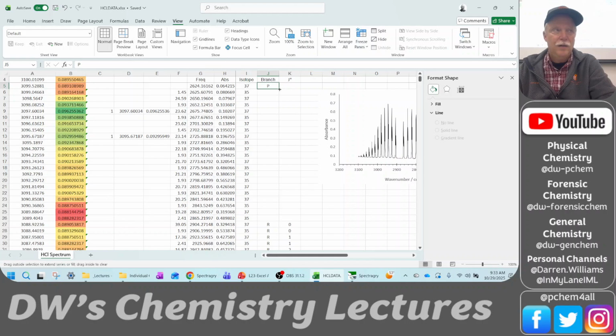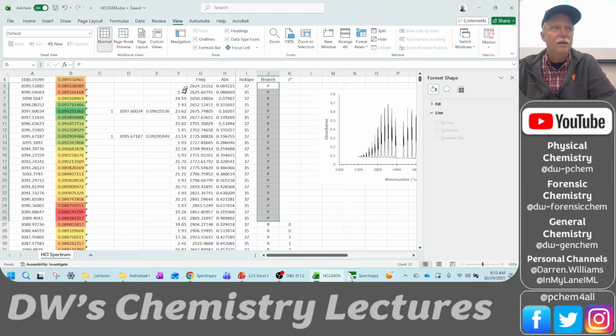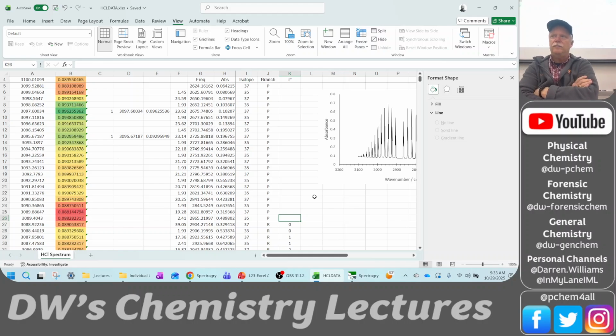Yes. Any question? Yeah, because there's nothing above it. That's fine. And then, what's the first P value? The first P line, like the designation, the J value for the first P transition. We don't have negative rotational quantum numbers, so that's why we can't have a P0. You remember stuff that you miss, right? That's right. If you started at P0, then the upper J value would have to be -1, and we can't have a negative J value.